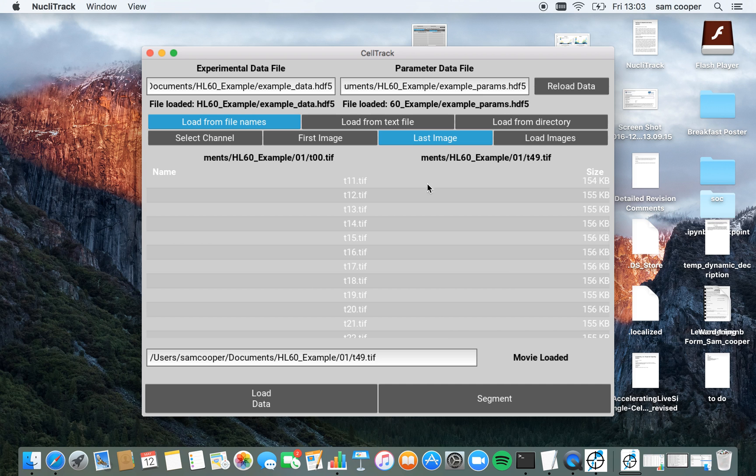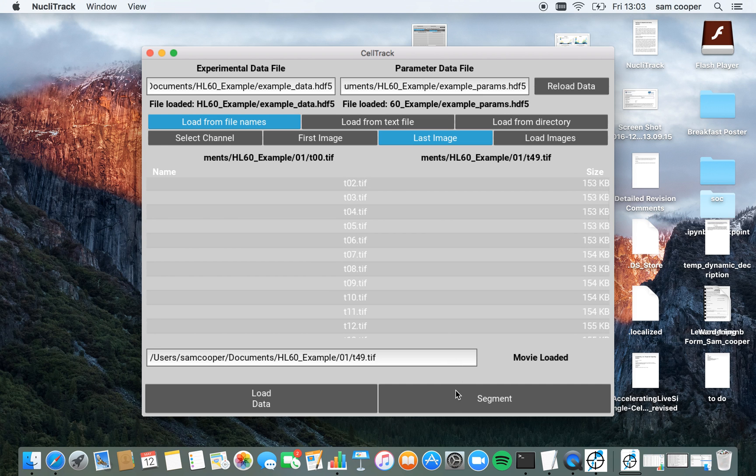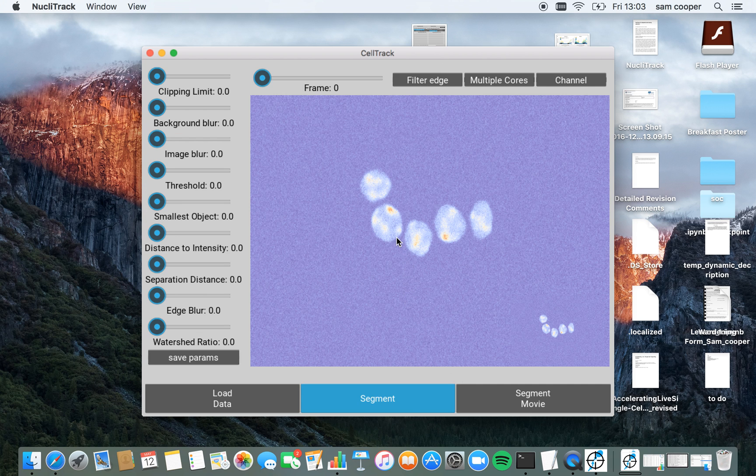Clicking load images now automatically loads all of these images. Now these images are loaded, I'm able to segment them. So I click on this segment button here, I transfer to the segment user interface.